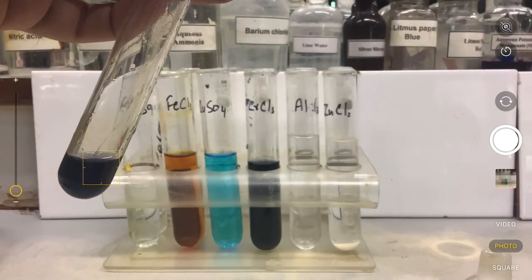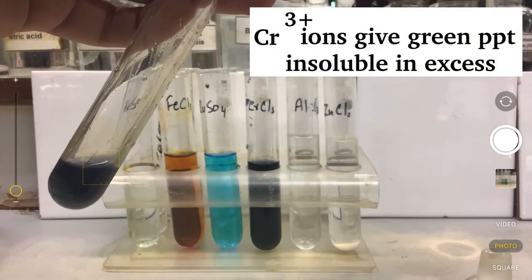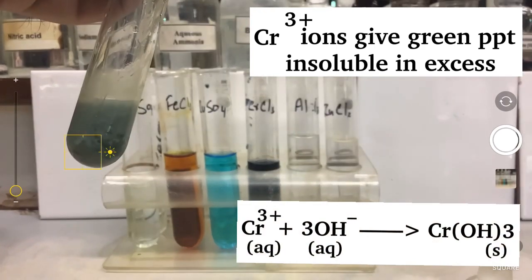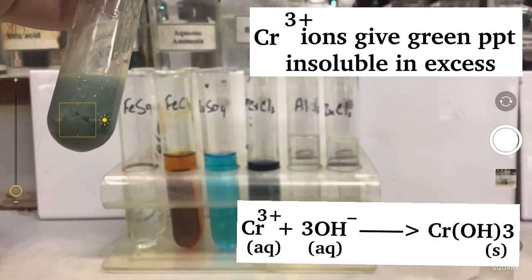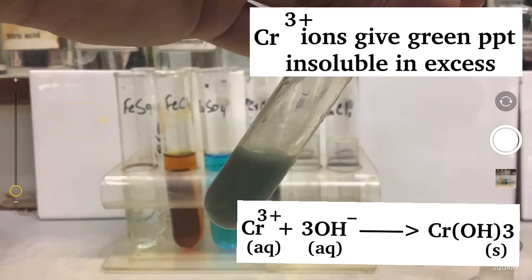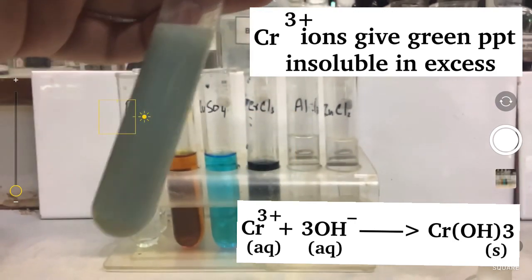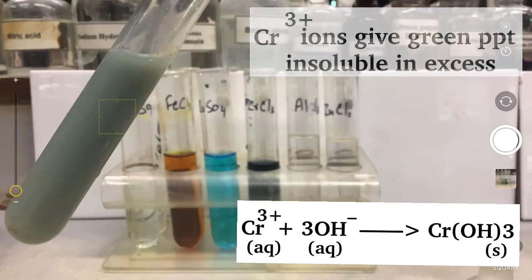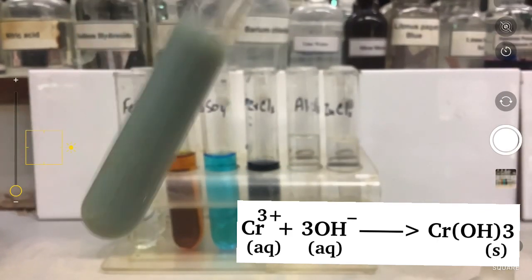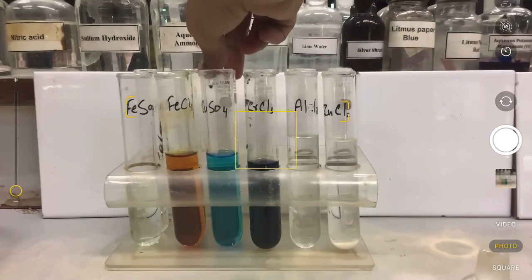When I add aqueous ammonia drop by drop, I will see that again some green precipitates are made. But read it, it says insoluble in excess, so in case of ammonia, these kind of gray-green precipitates will remain insoluble no matter how much aqueous ammonia I add. So this is one distinguishing feature. With sodium hydroxide, they gave me clear green solution, but with aqueous ammonia, the precipitates remain insoluble.